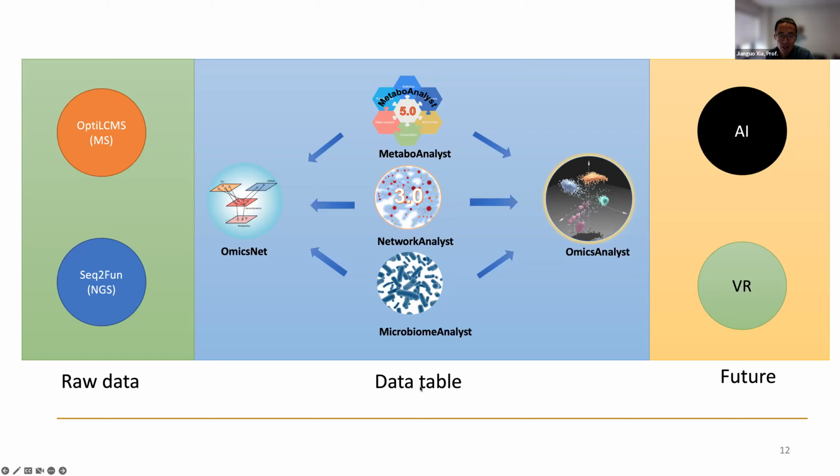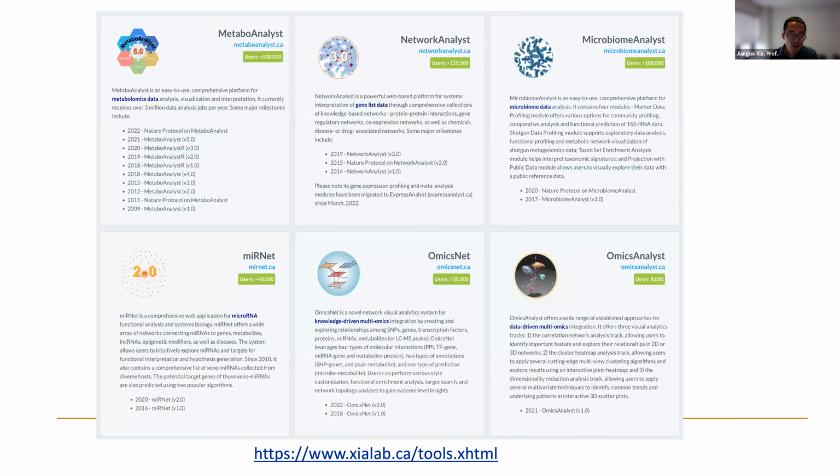And here, once we get a table, we can run it on a cloud, which is almost instant. You upload data, you click, and you get a result. So this one is more or less okay. And what we see in the future is that we are going to use more AI-enabled technology. We also think that VR, augmented reality or mixed reality will be more accessible in future. So overall, we think we will be able to make the data more affordable and data analysis more enjoyable, and we can do it.